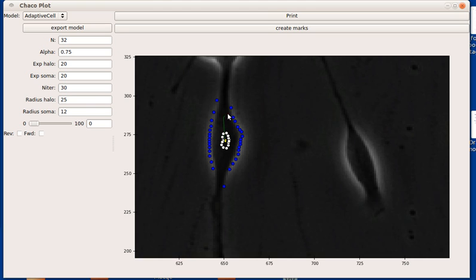Of course, increasing the number of model points will make the model more accurate in the shape, but it will also cost more time to track, and maybe also introduce some instabilities, because each triangle used here is thinner than the previous one. So I will get back to 16 here, and 16 is a good number for this kind of cell size.